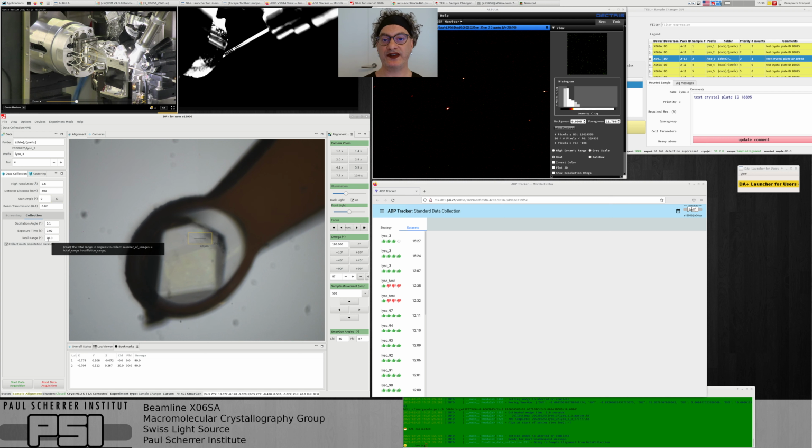So you're having then 3 different data sets in this situation. Oh, I didn't put the bookmark here yet. There. Very good. Now I have 3 bookmarks. 1, 2, 3. Different chi angles and different phi angles. You can put whatever combination you want, as long as it's within the limits.